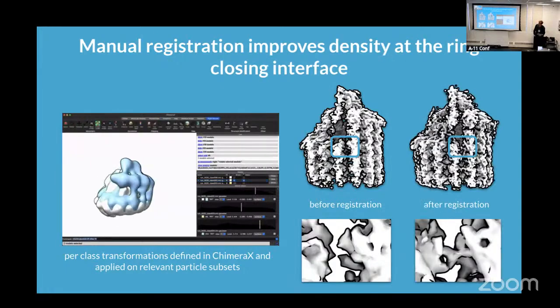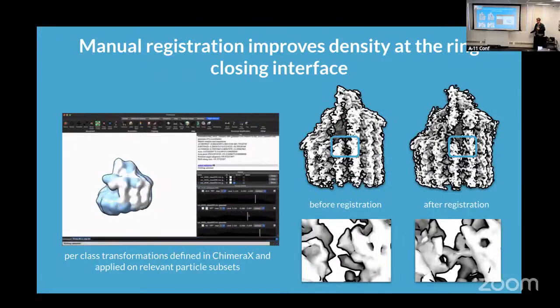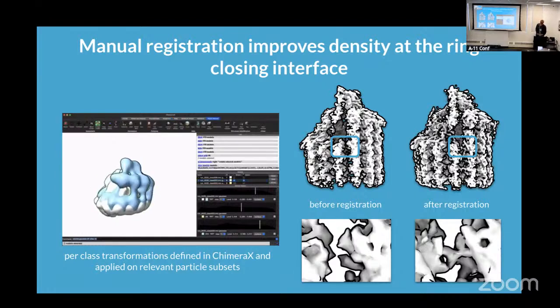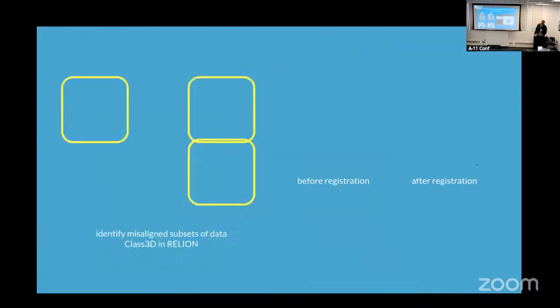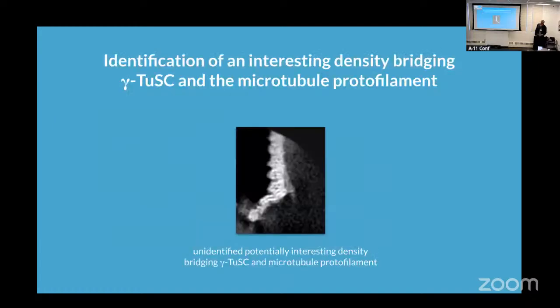we saw that actually this interface, at what they call the seam of the microtubule over here, was really cleaned up quite a lot. And they saw some specific linkage, which I don't know the biology too well, but apparently it's interesting, and apparently it was not a thing that was particularly known about before. Really great. I like enabling biology, not necessarily going much further than that. So yeah, we did that.